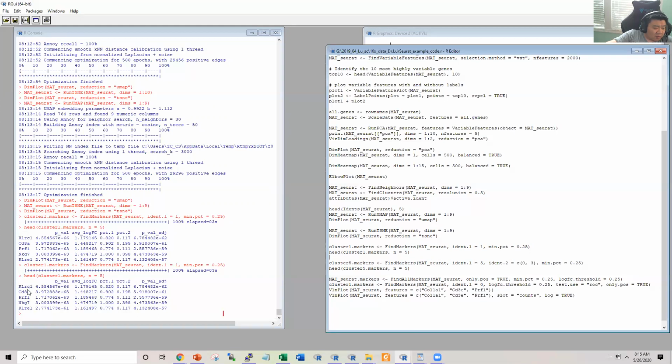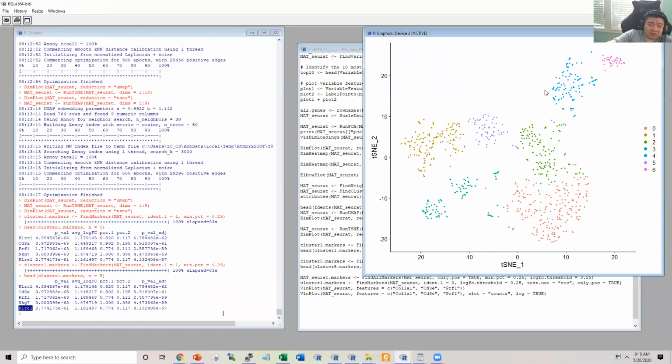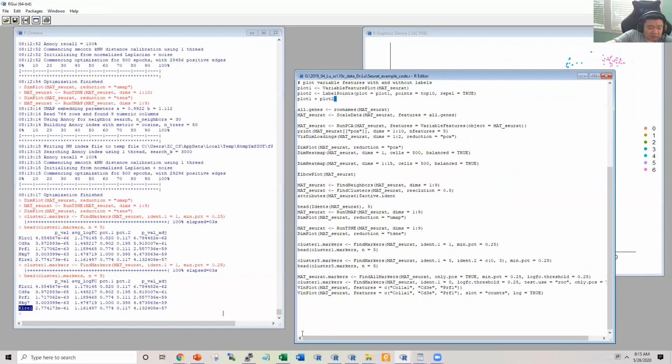We can see the top markers here, the killer markers, CD8A, perforin, and NKG7, and another killer marker. So this should be an NK cell, TNK cell. The cells were all selected based on the CD3 markers, and there are also certain fibroblast cells there, with certain fibroblast markers. So I consider that the NK cells have mostly been excluded. So here these cells should be the TNK cells.